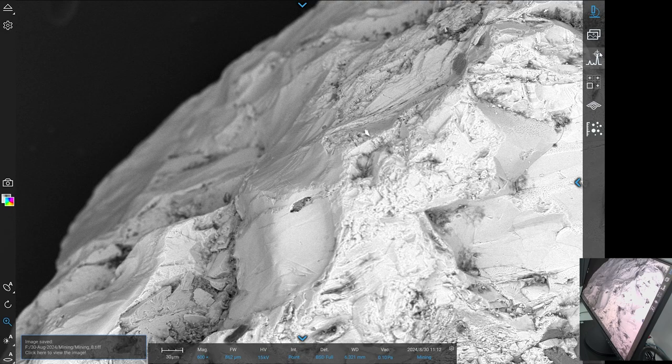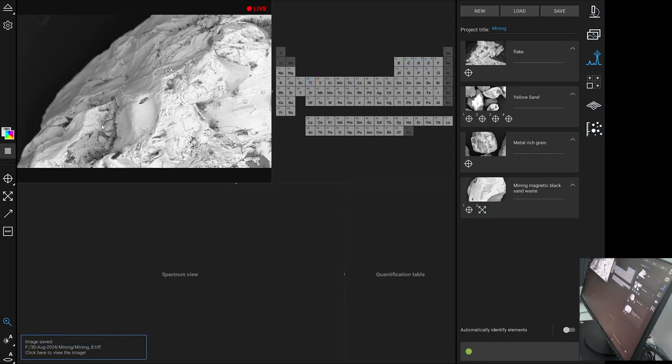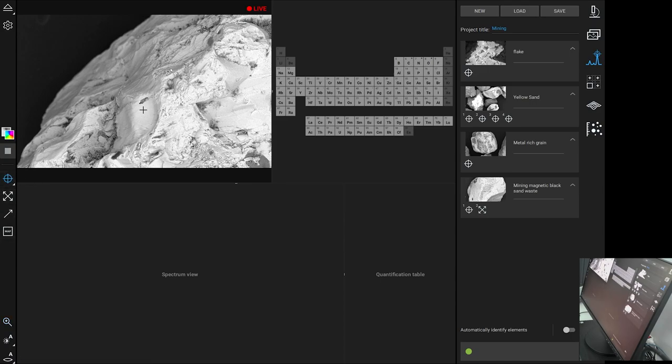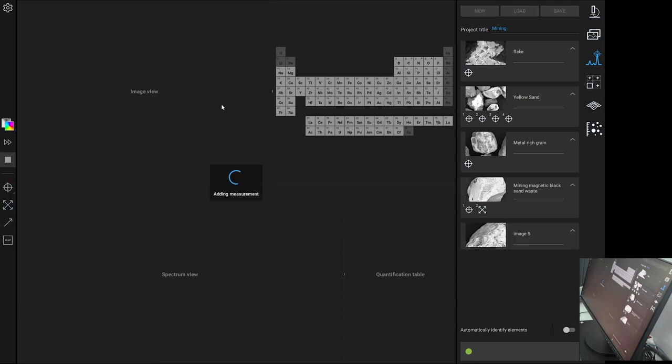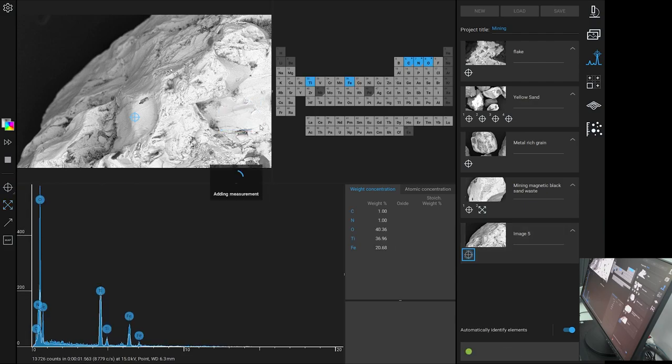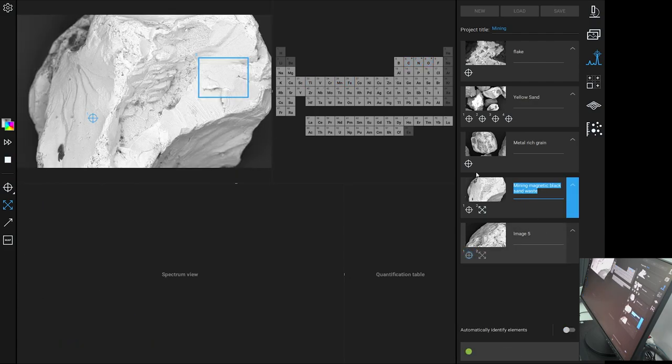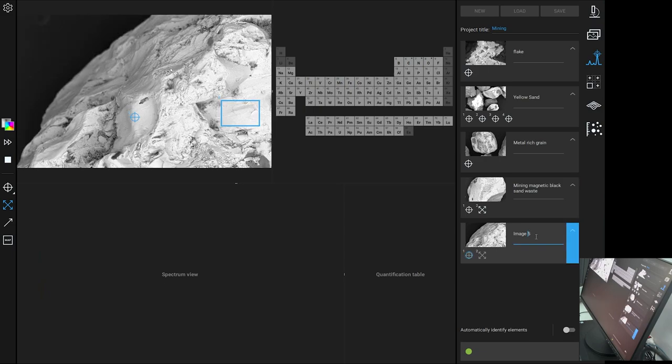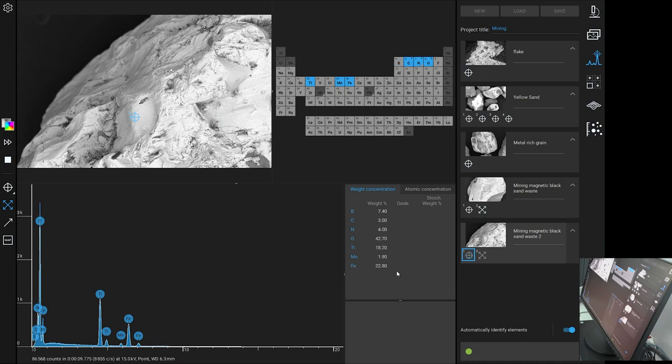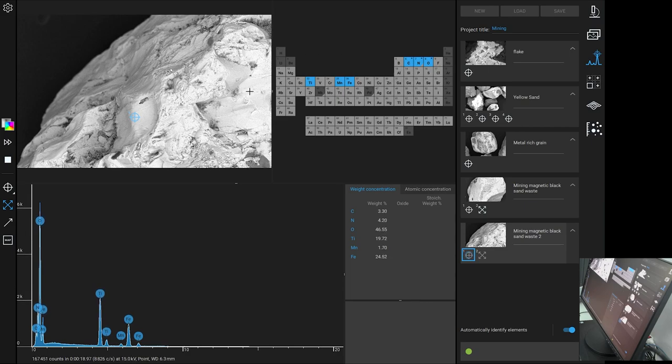And then we will take some sample points on this as well. One small sample point and one area. So what have we got? Iron, manganese, titanium oxides, essentially. We're going to have a closer look. There's some interesting structures here. So we'll have a quick look at that.